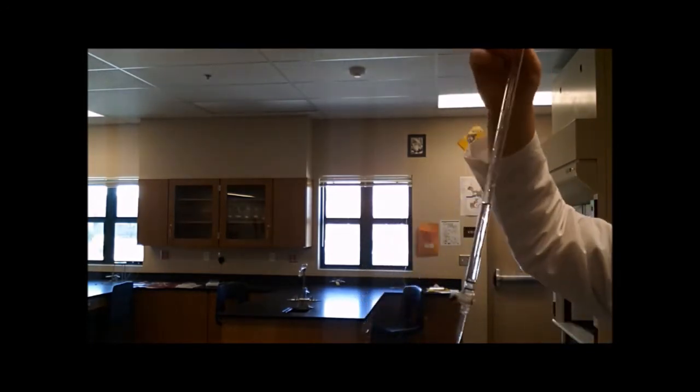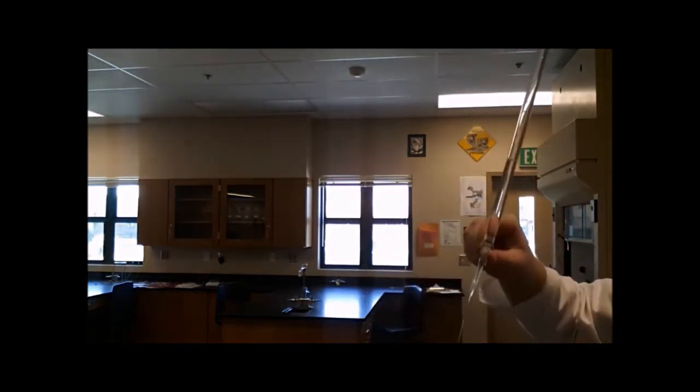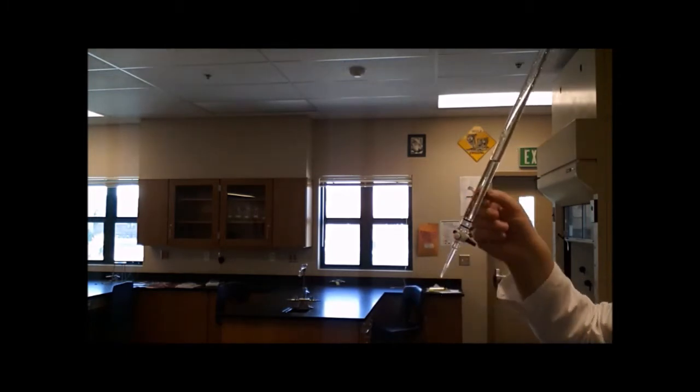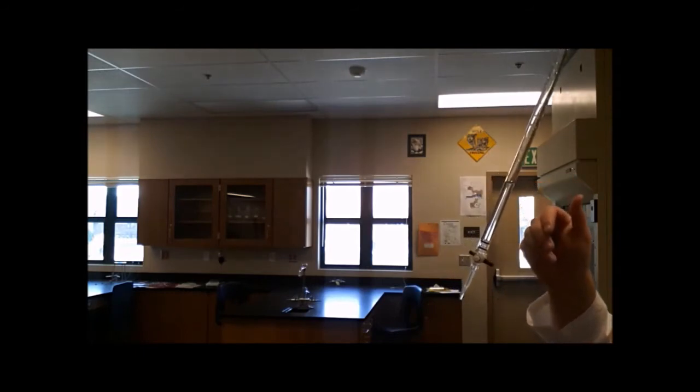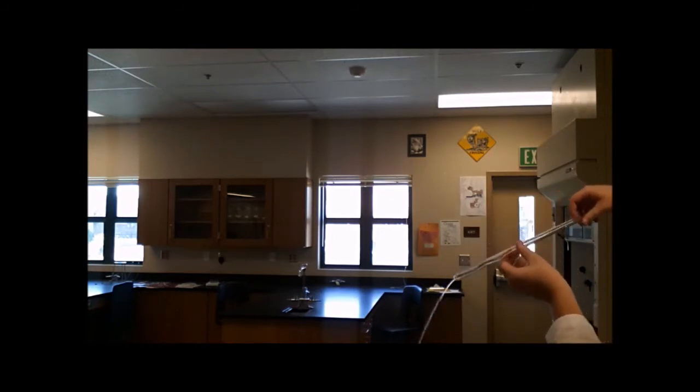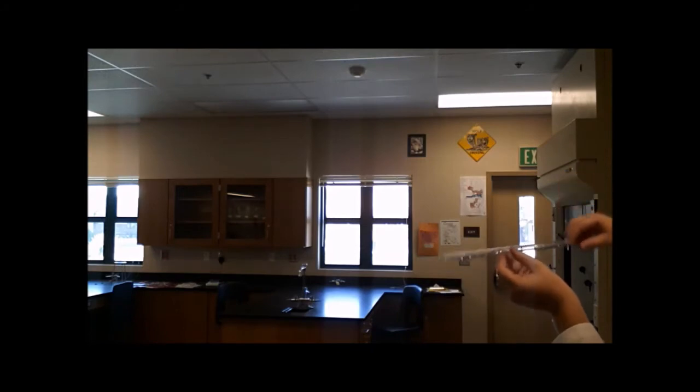So I'm going to open the stopcock and let some of the sodium hydroxide coat the inside of the stopcock. And then I'm going to turn this upside down and, twirling, let some of the sodium hydroxide drain out, coating the sides of the burette.